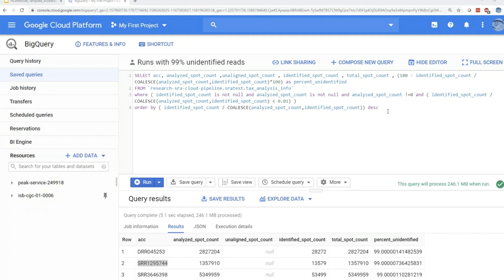And the contigs are available in both Amazon and GCP. So the other question was about the compute cost per assembly, but I think you addressed that when you talked about the cost that we incurred when we were doing those contigs. Yeah, unfortunately, I can't answer the question of cost per assembly, but I can certainly get in touch with whoever asked that question to talk to you more offline about that topic. Yeah, that's a good idea. So you can certainly write in to the webinars address if you want to, webinars@ncbi.nlm.nih.gov.